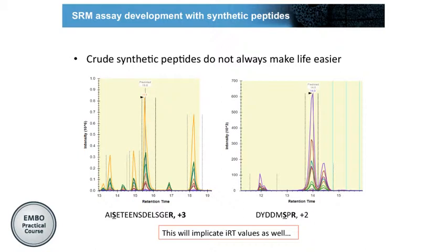First one, we have a modification that, when we divide it by 2 or 3, the charge state, we will get a modification that is actually within the window of the Q1, but it affects chromatography, so they elute at a different time. In this case, we have a peptide that has a group that can go through deamidation, and then we would get different forms. What else? Which modification on a protein and a peptide has a change of 0 in mass?